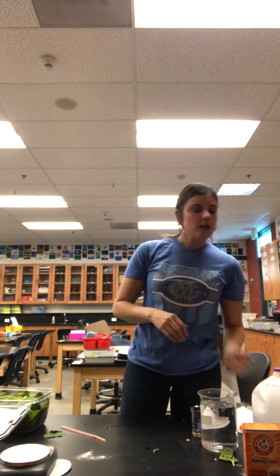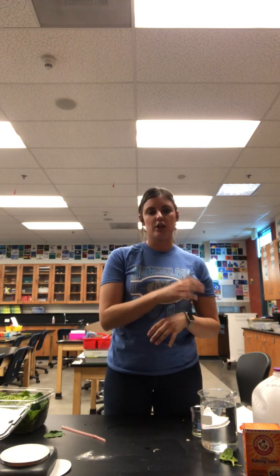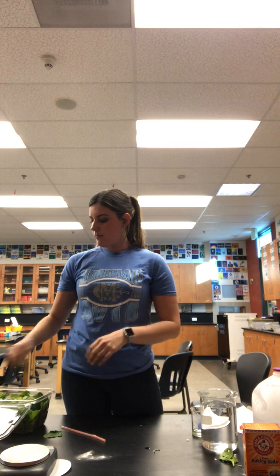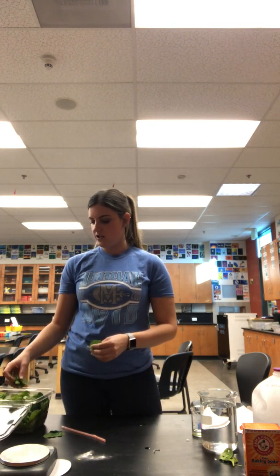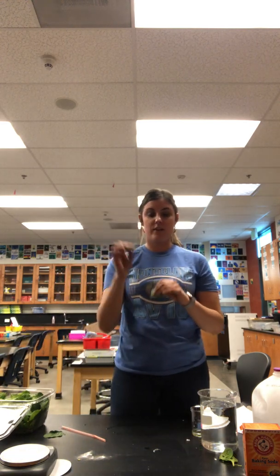Knowing that those three things are the inputs for the reaction we're looking at in plants, we should be able to describe how manipulating one of those three factors would affect the rate of that reaction. Today we actually get to do a really cool lab to see the effects of one of those inputs on photosynthesis. In this lab, we're going to be using spinach leaves, and we'll be looking at the rate of photosynthesis in these spinach leaves, which is super cool.